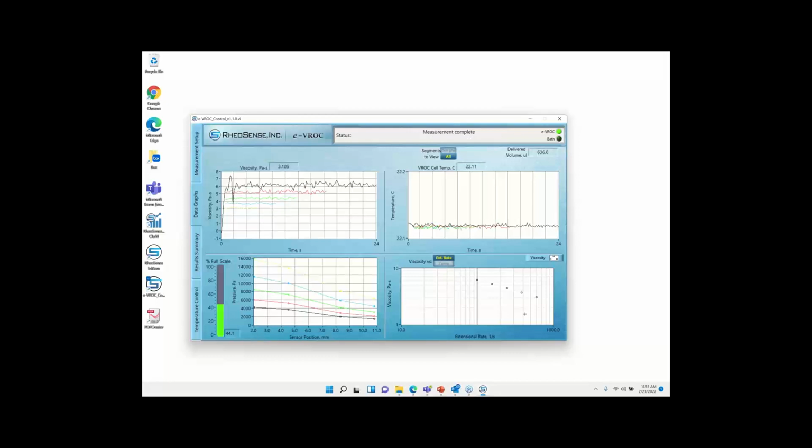Okay, so you keep measuring the same sample over and over again and you get different data. If you've confirmed that your system is performing properly with the standard oil or another viscosity standard, which we recommend doing regularly, so you're confident that the chip is healthy and your pump is functioning and all is well there, that's the first thing to check. You want to check the health of the system with the standard oil where you know the viscosity, or it could be an aqueous-based standard too. The second thing is to start looking at your sample a little critically. Ask yourself, is it homogeneous?